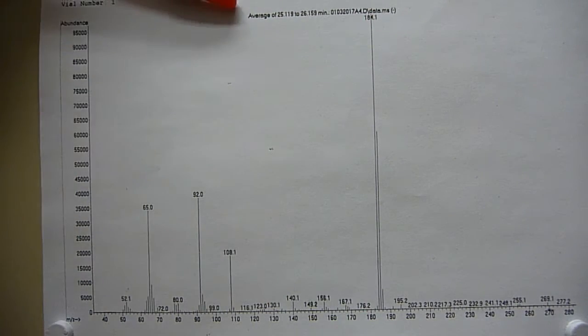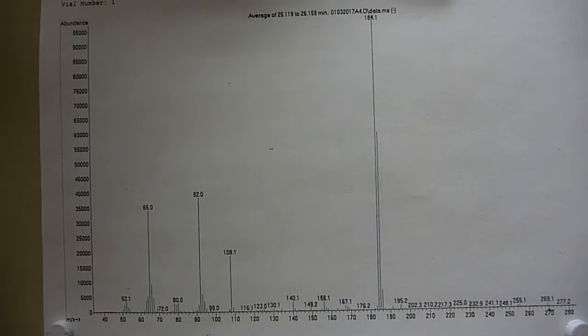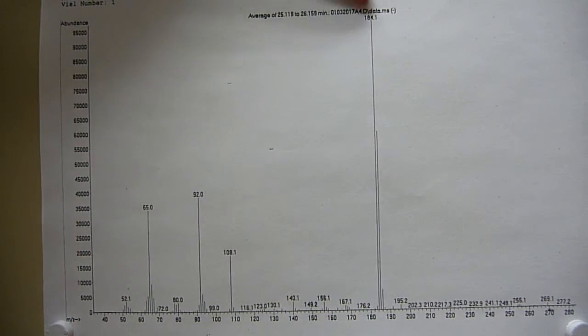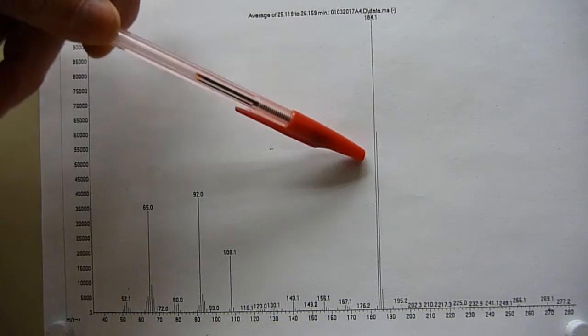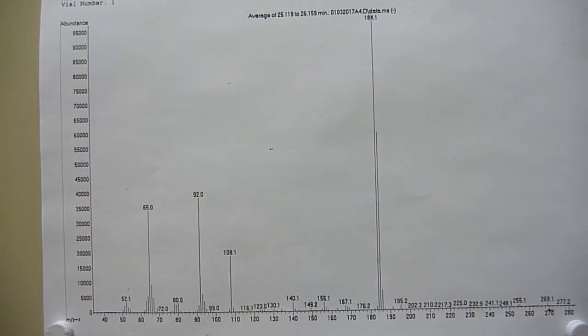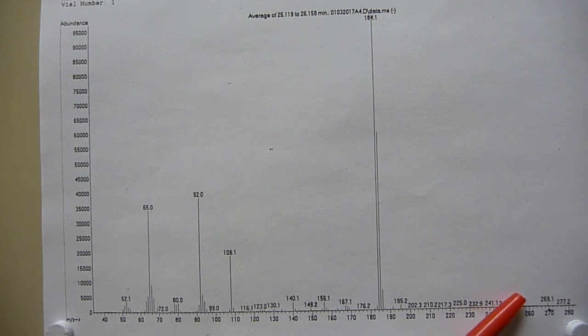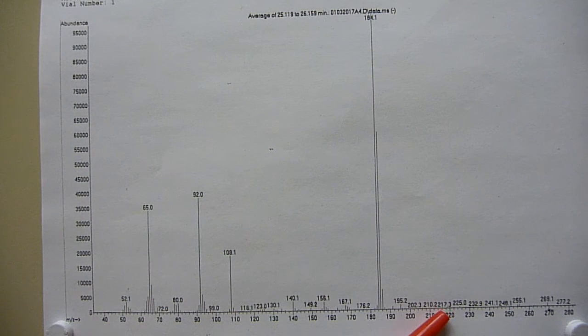This is Electron Impact — most energetic. Big 184, 185. No indication of molecular ion whatsoever.